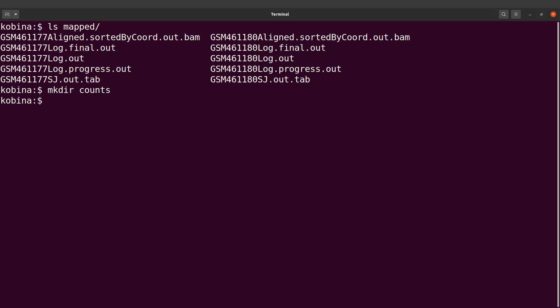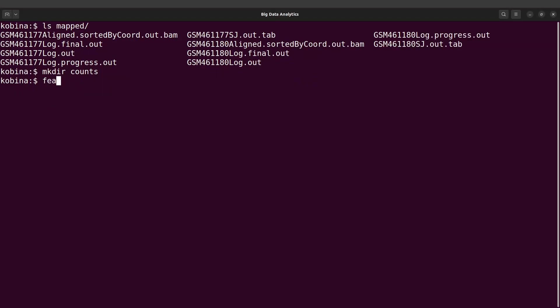We will say featureCounts and then specify -T 8 to set the number of threads. We will now specify -S 0. The -S option is used to specify the strandedness, and here zero means unstranded.